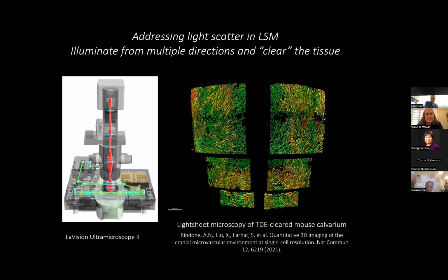This is obviously epitope tagged proteins in the mouse. I think this is immunofluorescence, actually. It is immunofluorescence, I believe. I should know that, but I don't. Some of the other ones will be. And I think what you're going with this is how the hell do you do immunofluorescence of big, thick tissues? Yeah, right. Well, we'll talk about that. I apologize. I think this is actually immunofluorescence, and so we'll get to that issue in a moment.